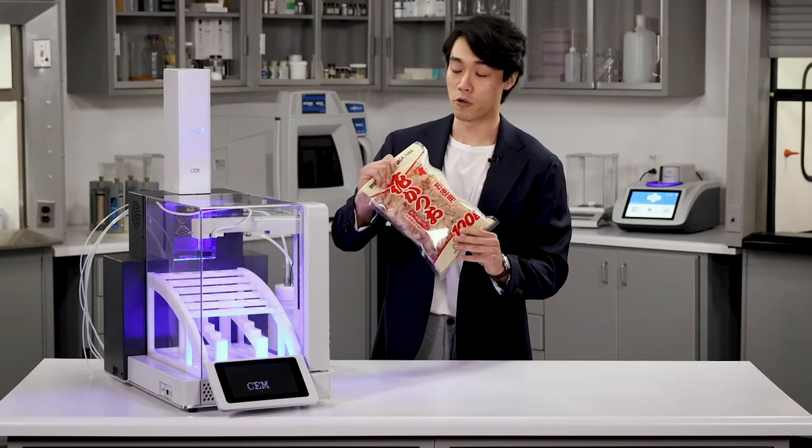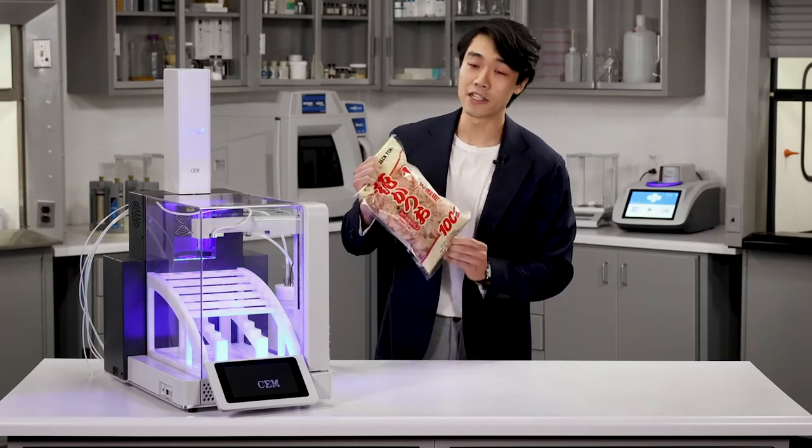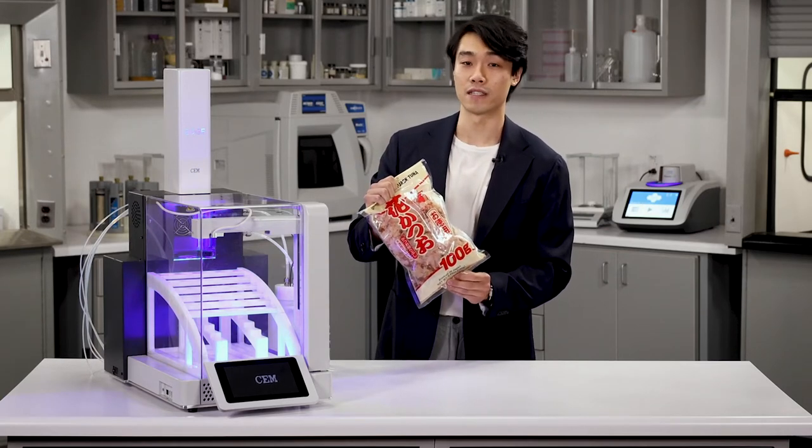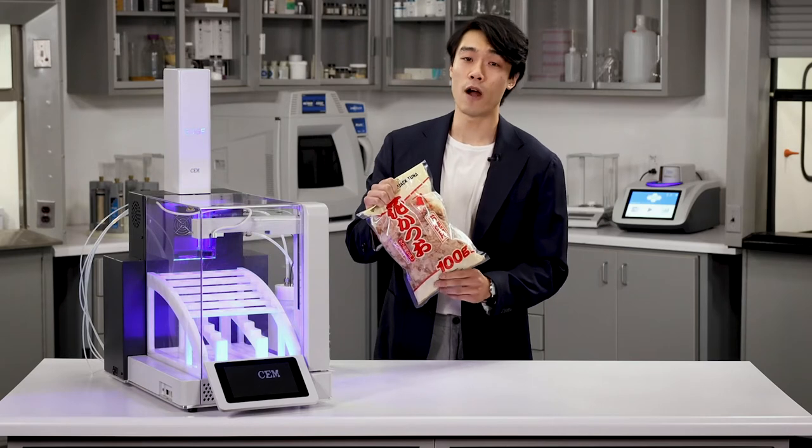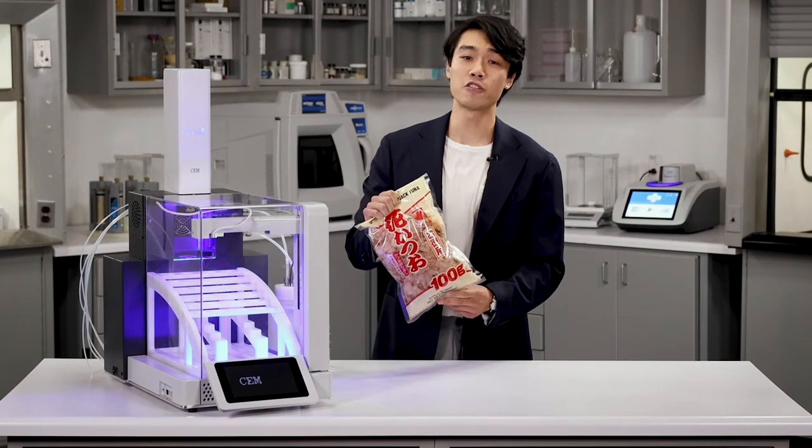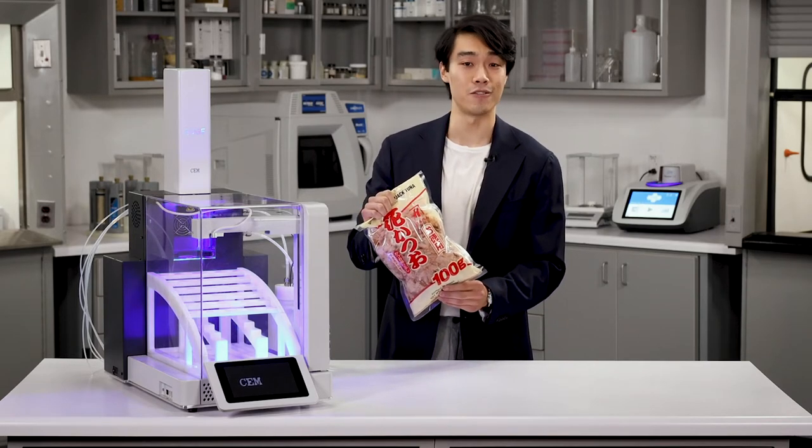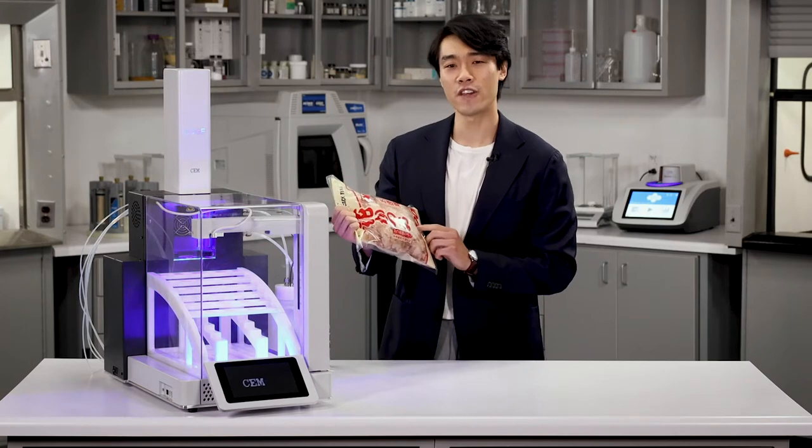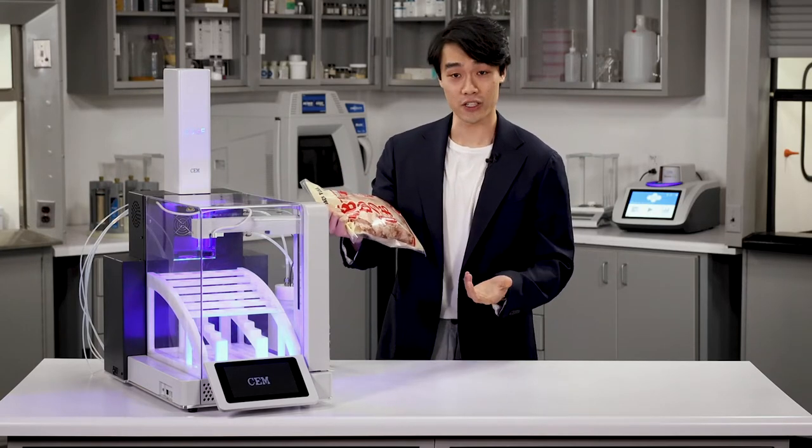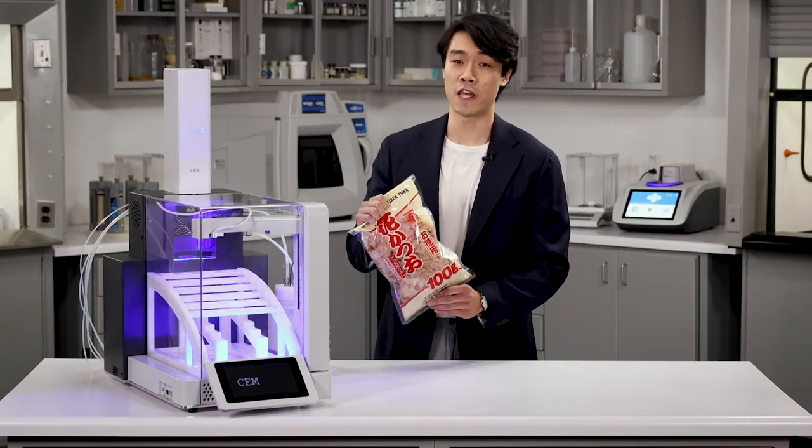This, my dear audience, and you'll excuse my pronunciation, katsuobushi, also known as bonito flakes, is used in a variety of Japanese cuisines. It's used to make dashi, a broth basis for soups, and also as a topping for foods like okonomiyaki. Its distinct umami flavor derives from the fact that it's made from dried fermented skipjack tuna. Now, how does fish go from fish into flakes? Well, I think that's a tale for sample prep.